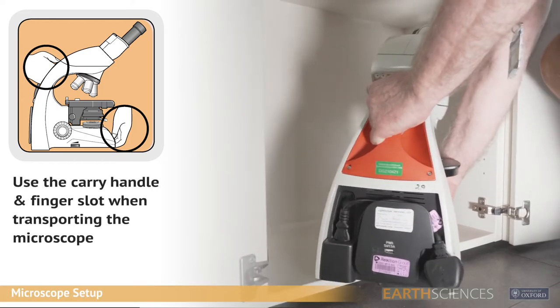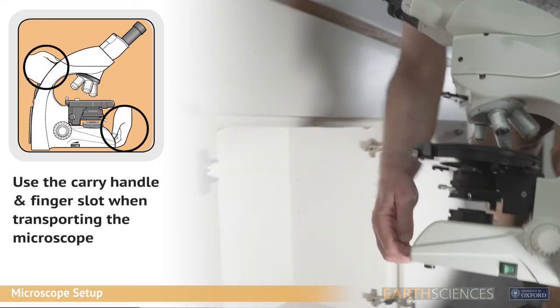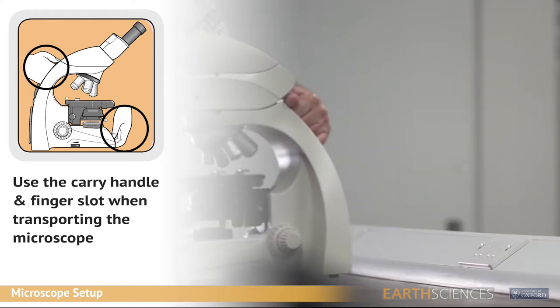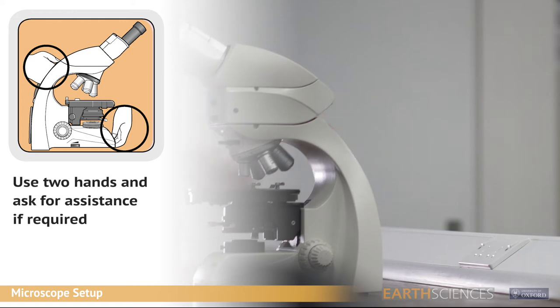At the back of the microscope stand is the orange instrument carry handle. This must be used in conjunction with the finger slot at the base of the front when moving the microscope. Always use two hands when transporting or moving the microscope onto the desk for use.